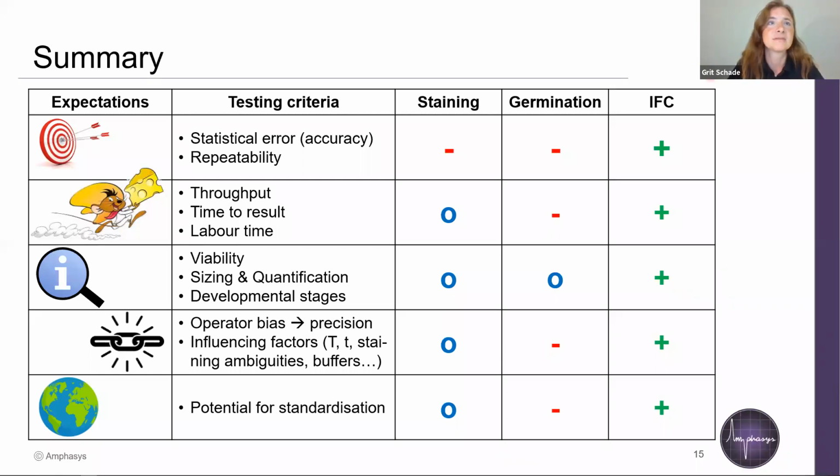I think if they want to apply the pollen, they can check it. I think with our device it's possible also to check it in the field. Sure, I mean, it's a portable device in a way. If there is the risk that the pollen is dying on the way to the lab, you should for sure try to measure it in the field, which is possible with our device.